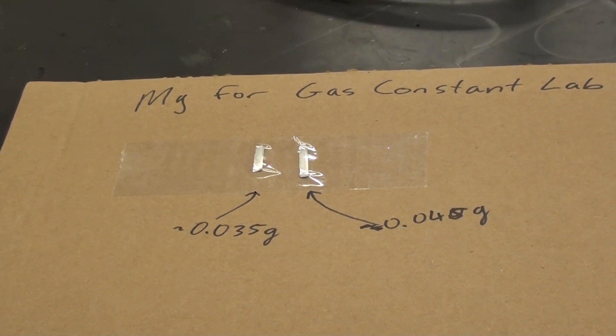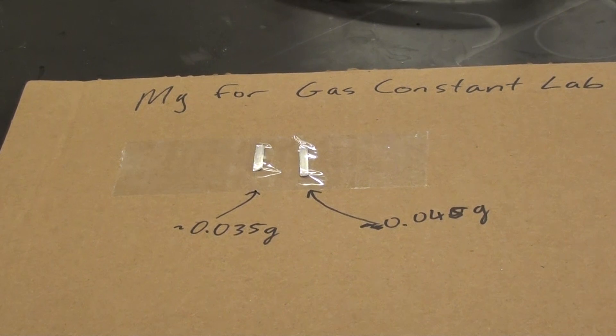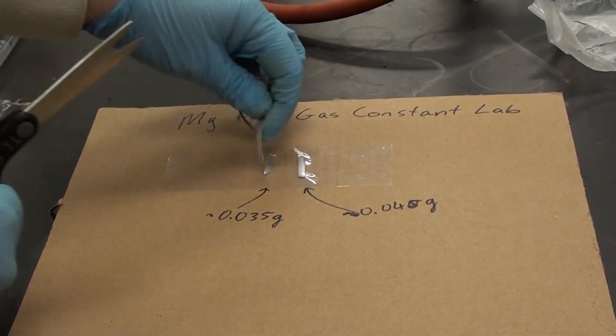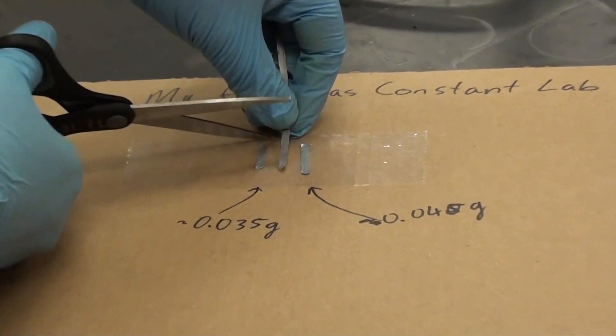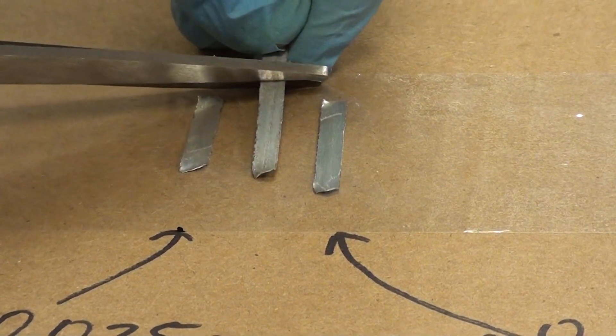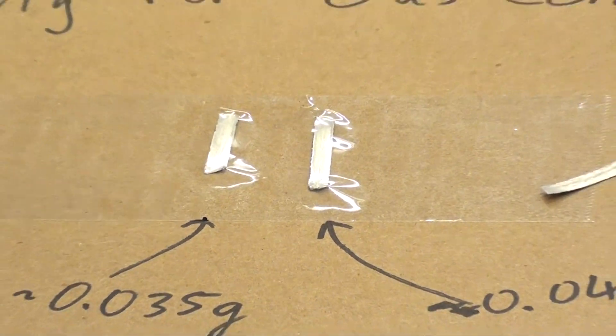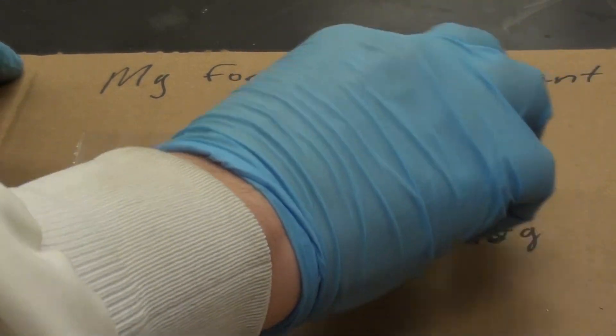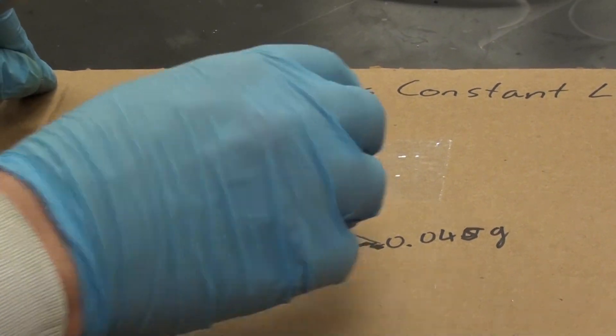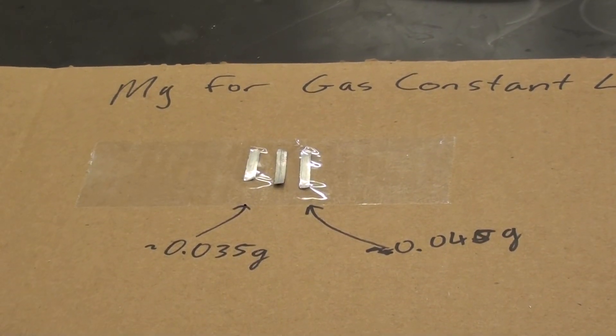So I'm going to cut off a piece of magnesium that is about that length. I will use scissors here. You could just tear it with your fingers but I think it's a bit easier and more accurate using scissors. So I'm just going to cut a piece and hopefully it will lie in length between those two. That's good, that's what we want.